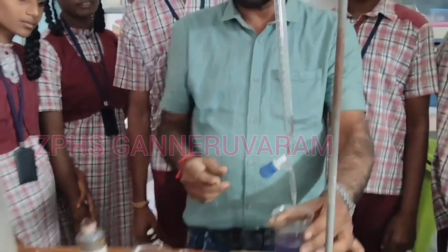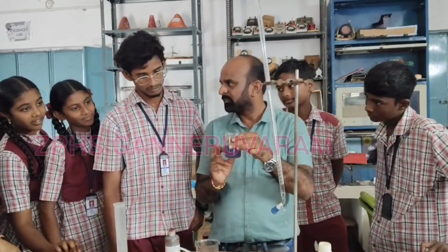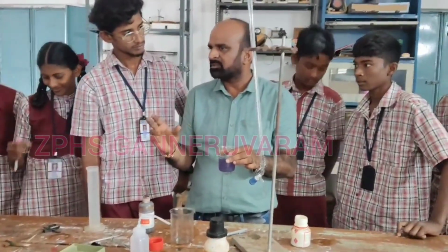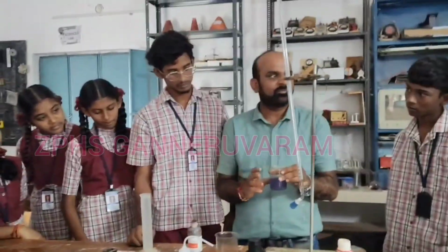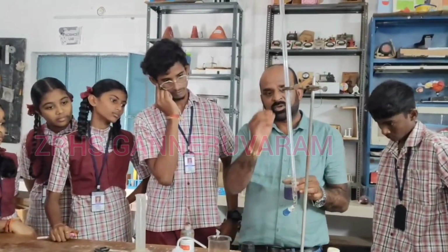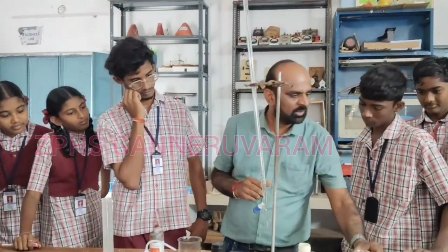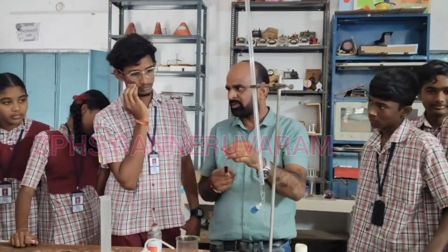So stop. Why does this color not change? Why must it change now? Because I have taken more sodium hydroxide pellets in the water. So the concentration of the sodium hydroxide is more, and the concentration of the HCl is very less. That's why it does not change to red color. We have already done this experiment.